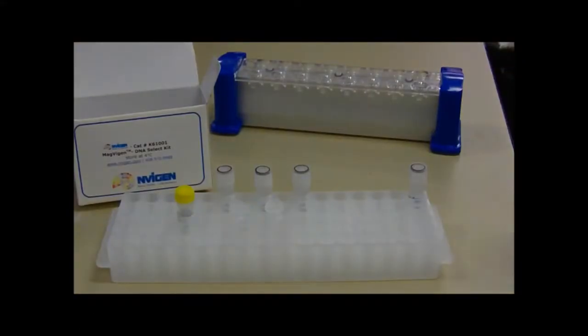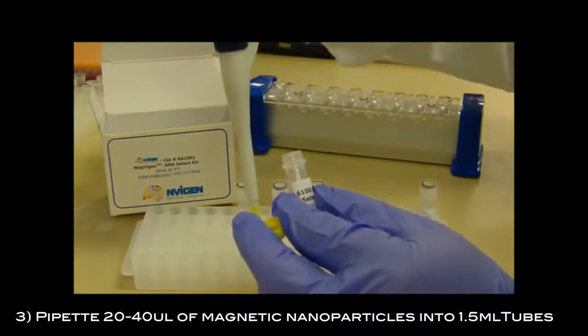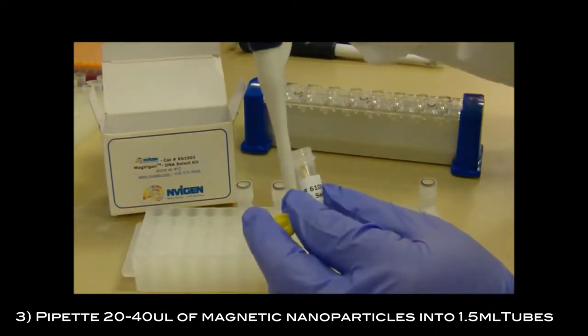Vortex nanoparticles to mix well before use. Take 20 to 40 microliters of magnetic nanoparticles and put them into clean 1.5 milliliter eppendorf tubes.